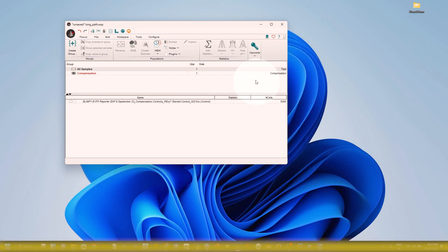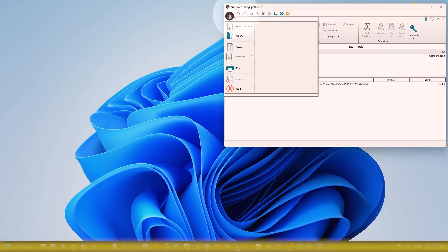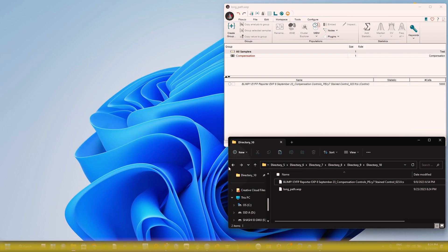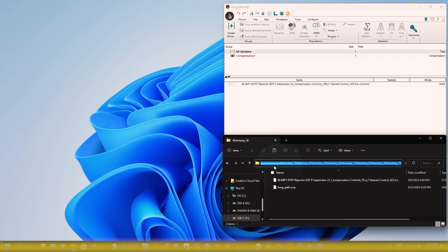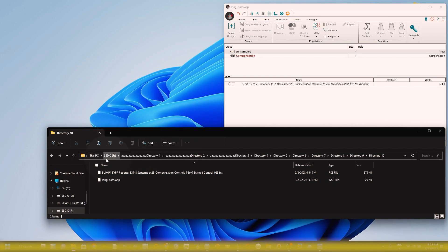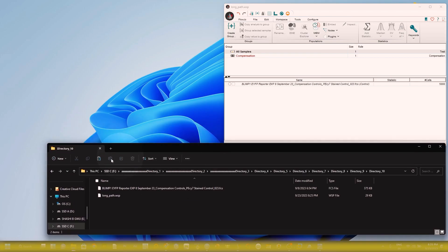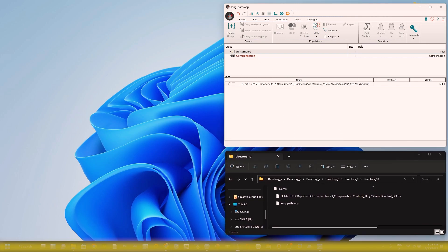Now I'm going to discuss why we are getting this error. First, I want to show you the WSP file I saved with a long path name. You can see here — I saved this WSP file in my F drive, with many nested directories: one, two, three, four, five, six, seven, eight, nine, ten. Under directory ten, I have both the WSP file and the FCS file saved.